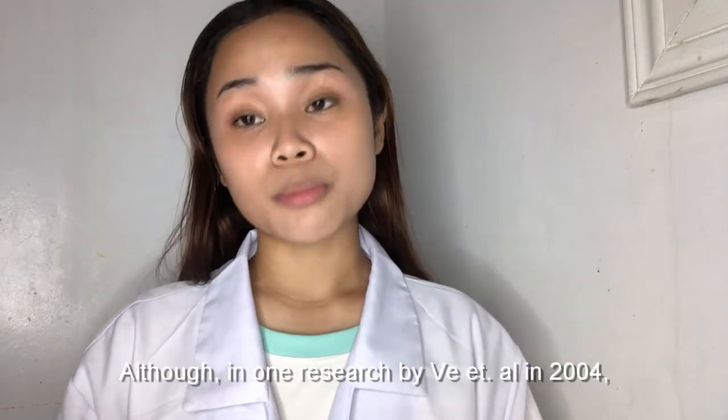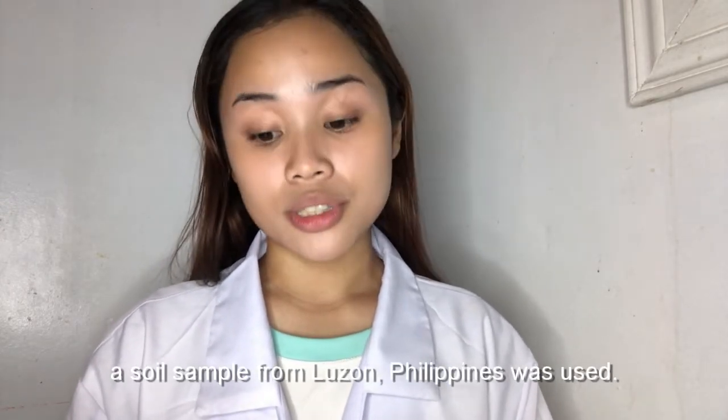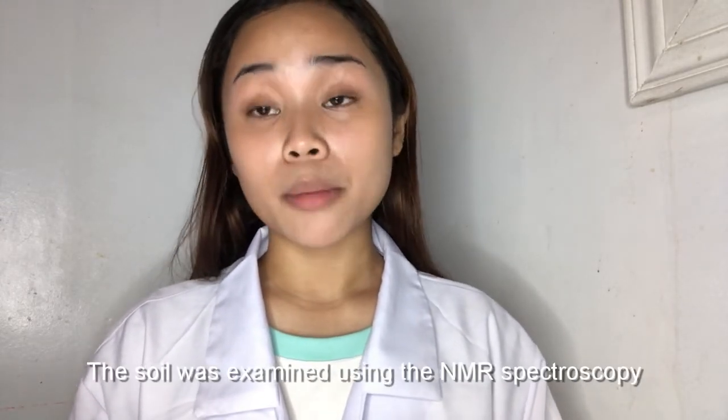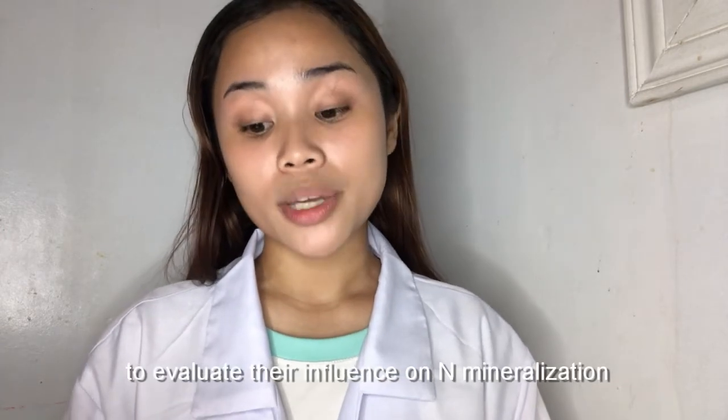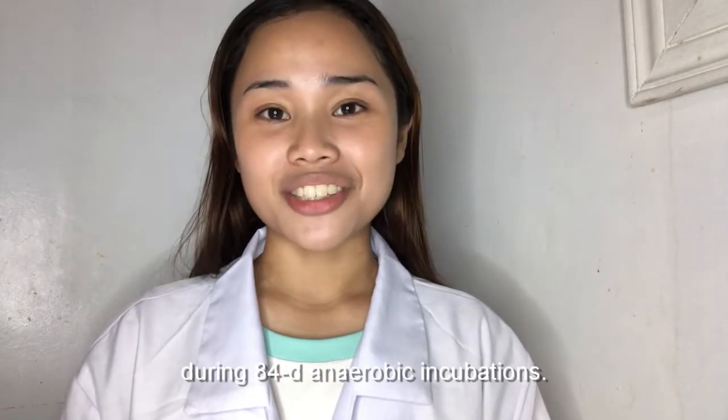Although in one research by V et al. in 2004, a soil sample from Luzon, Philippines was used. The soil was examined using NMR spectroscopy to evaluate their influence on nitrogen mineralization during 84-day anaerobic incubations.